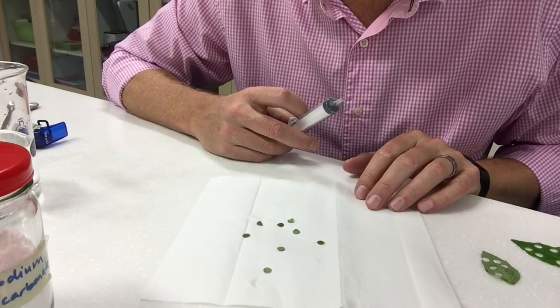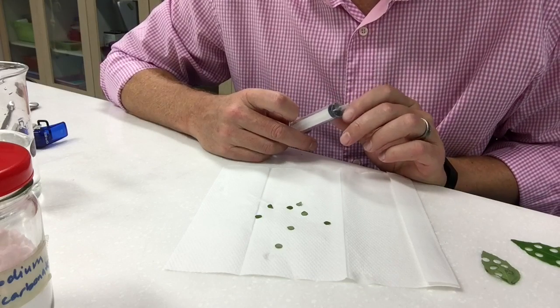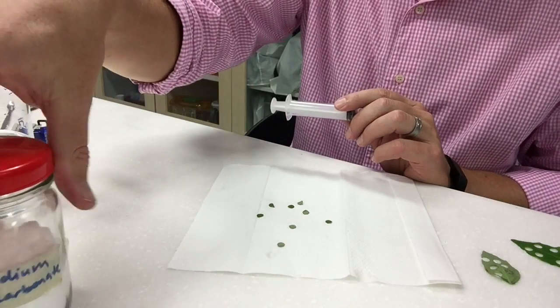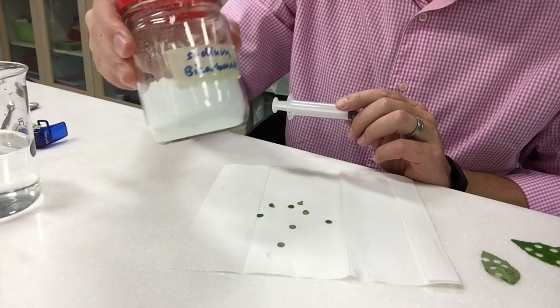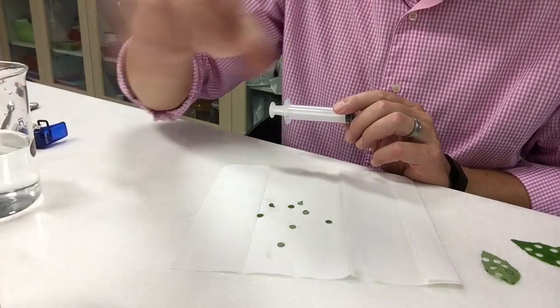So what we're going to do is we're going to use the leaf disc rising method. So what you're going to need for that is you're going to need some sodium bicarbonate, which is going to be the carbon source.